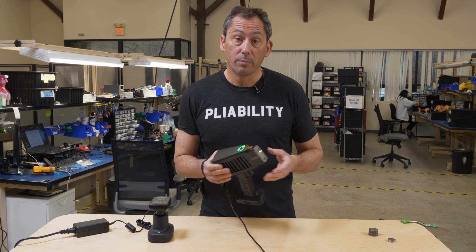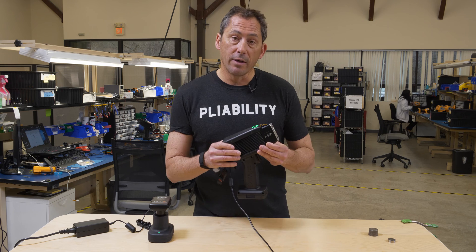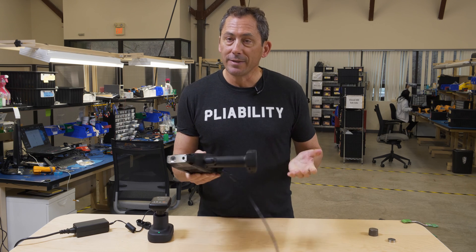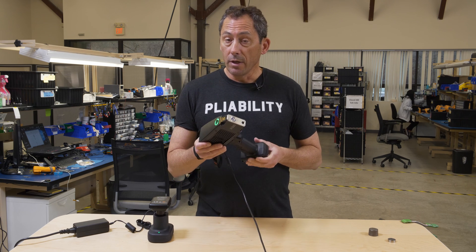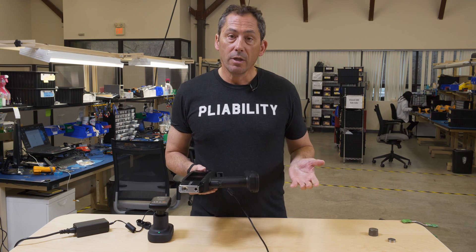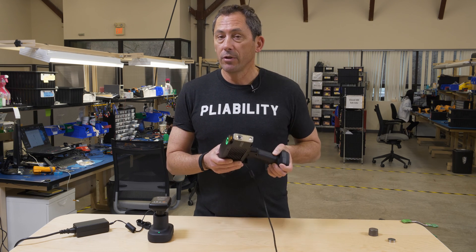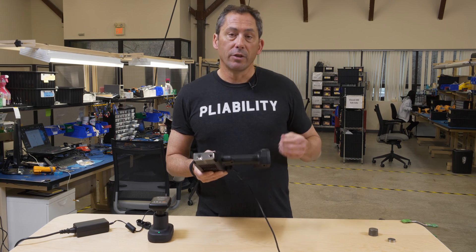We've had a lot of trade shows postponed or canceled, so a lot of people that want to see a new analyzer don't have an opportunity to do so in the near future, we hope. So what we're doing is making some nice demo videos of the product for a couple of different applications. If you're interested, you can contact us and we'll set up an online demo for you and any of your colleagues anywhere in the world, and if you want to buy a unit we can ship it to you.